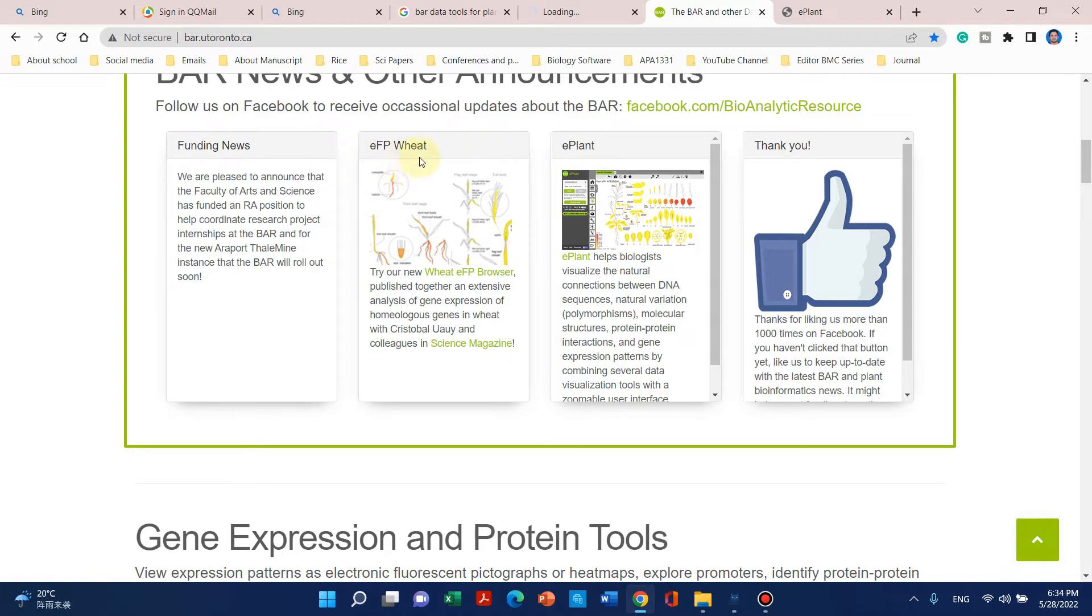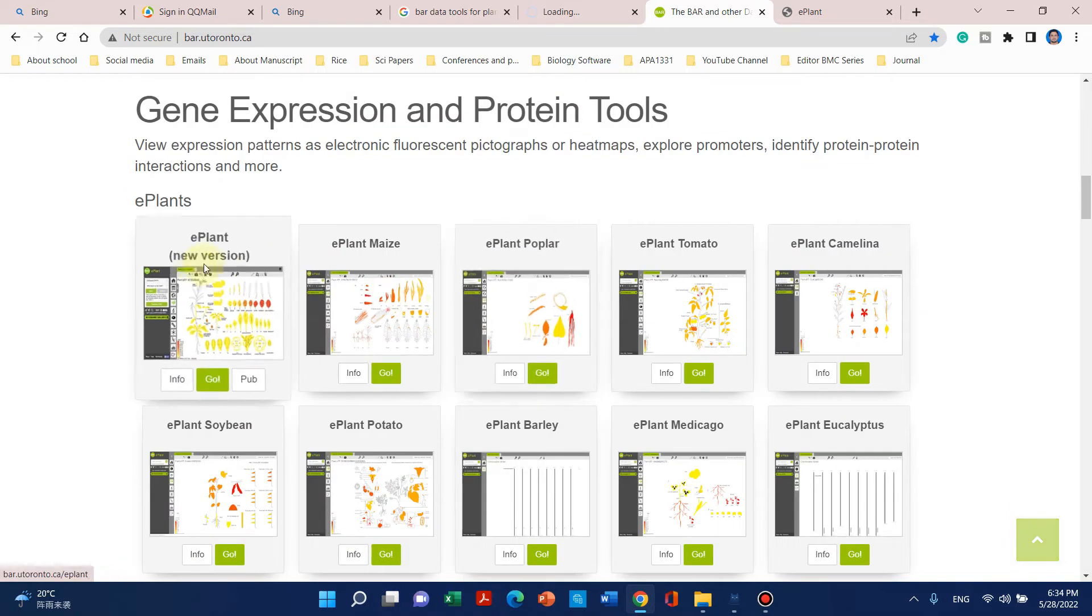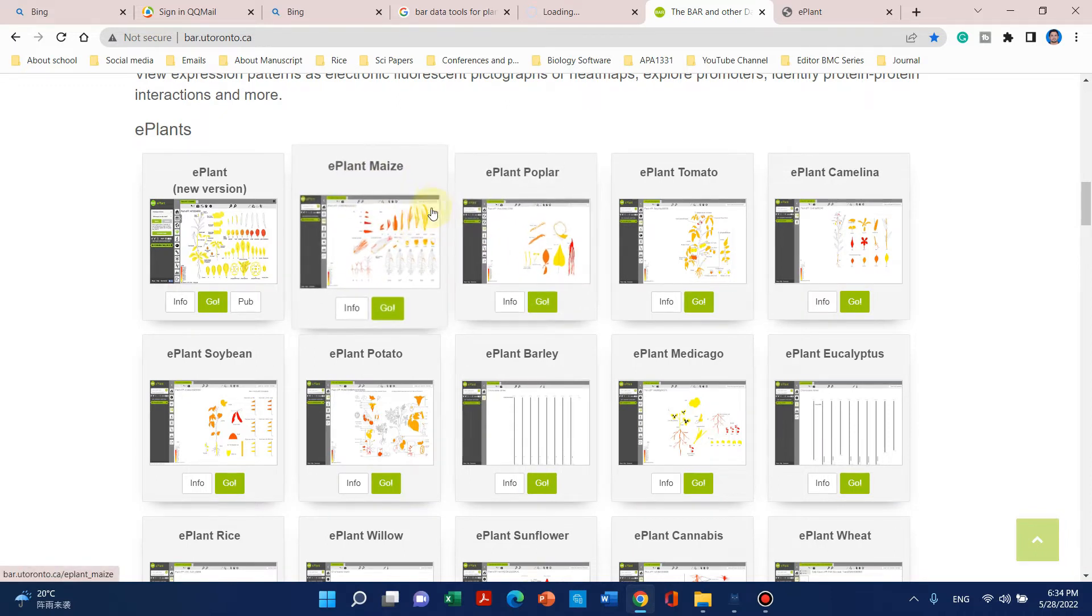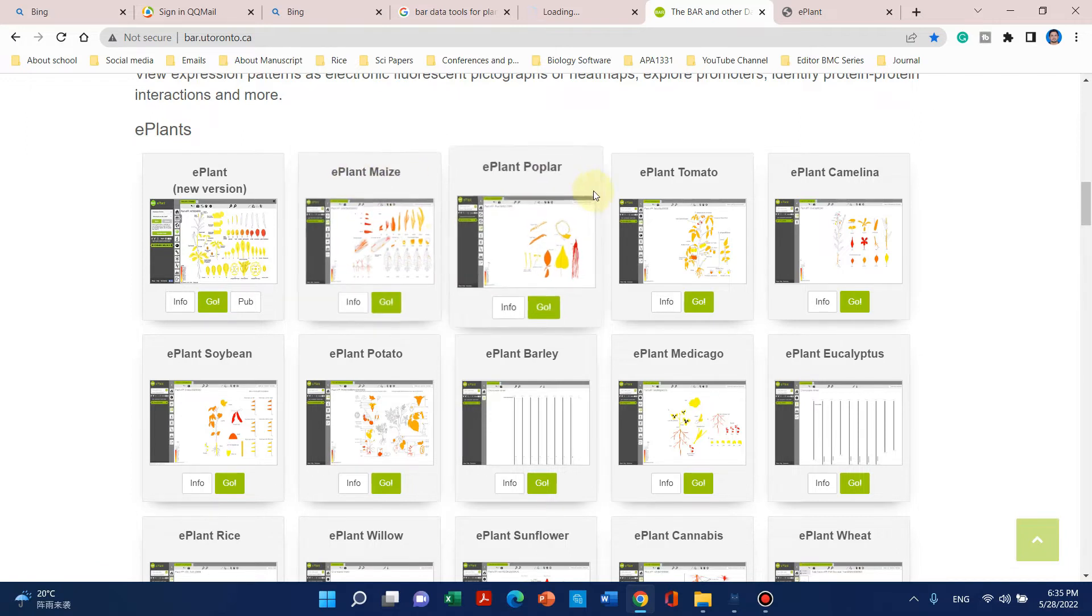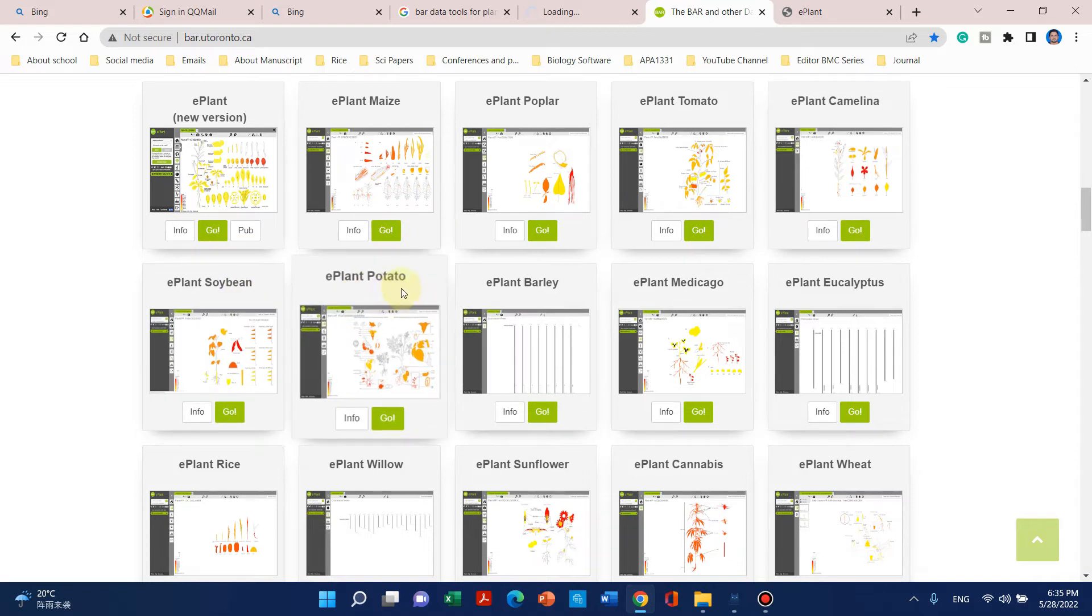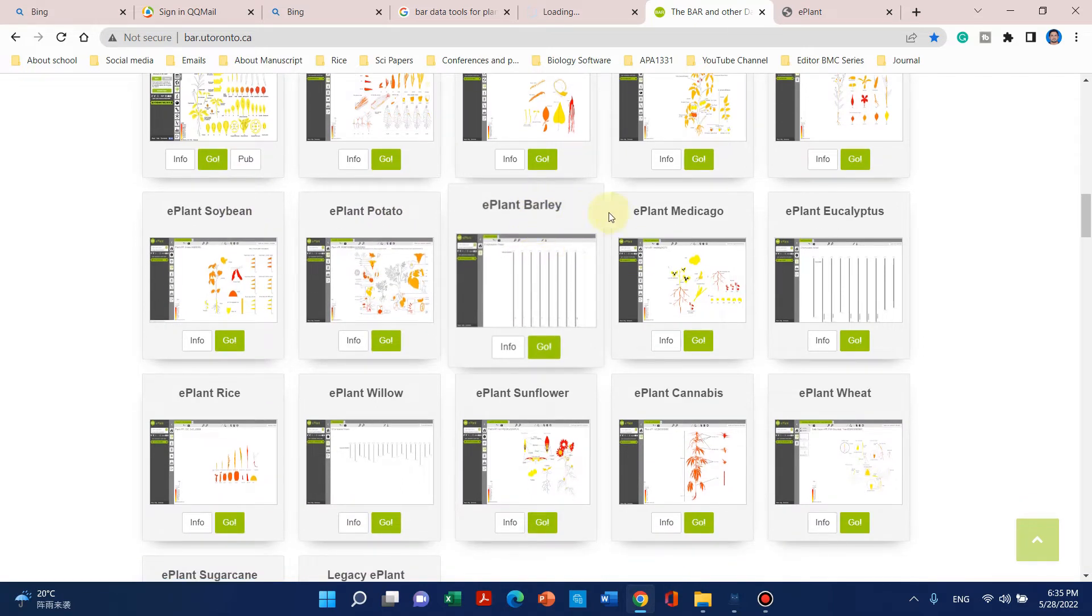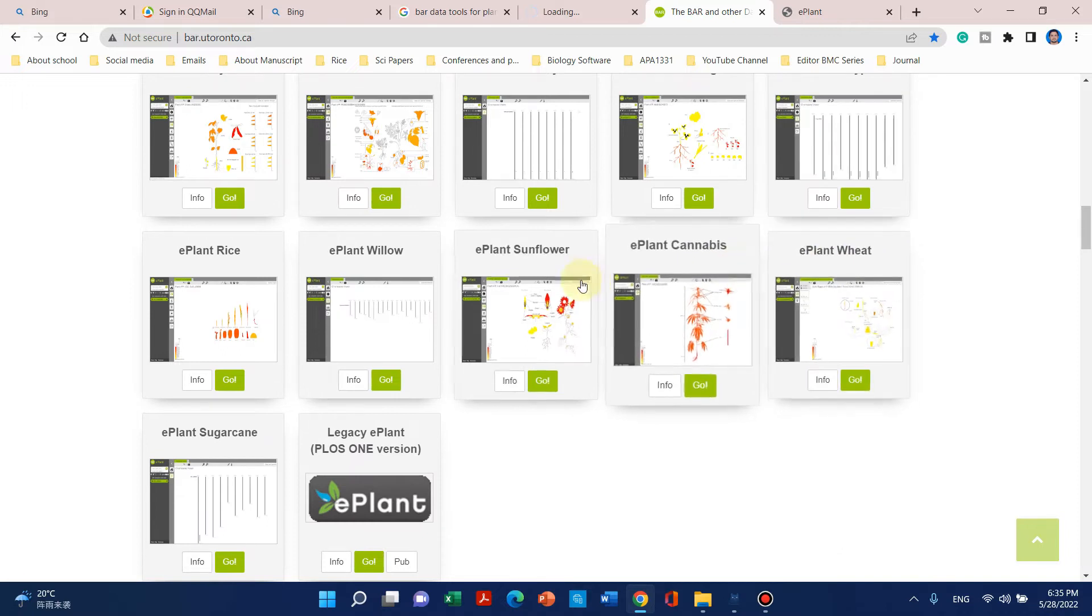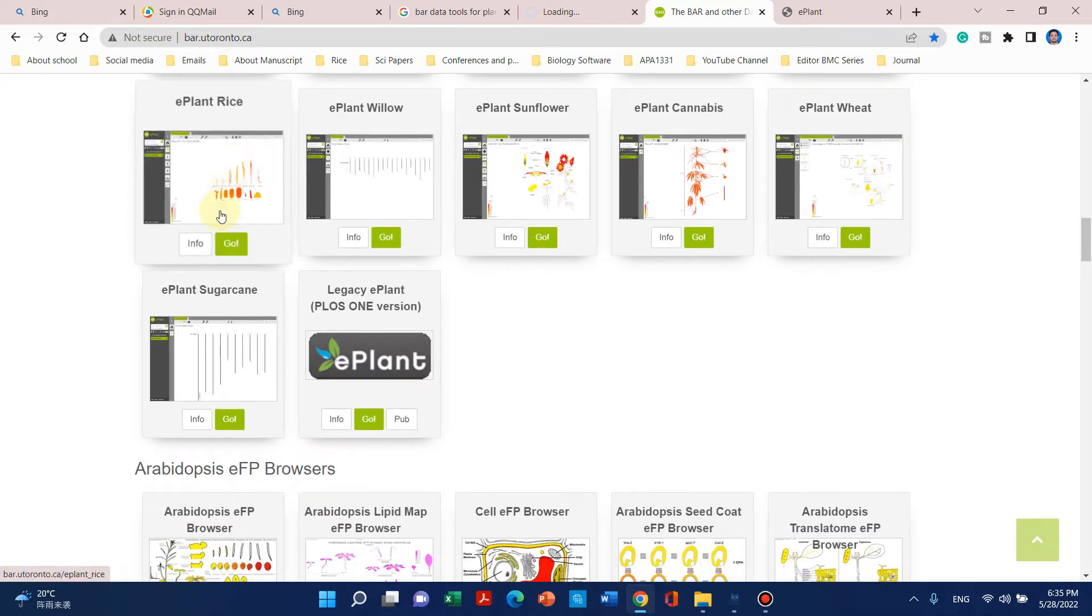We can use this for wheat ePlant, and the new version has been released. More and more crops are being included in this database like maize, poplar, tomato, camelina, soybean, ePlant, potato, barley, medicago, wheat, sunflower, and rice.